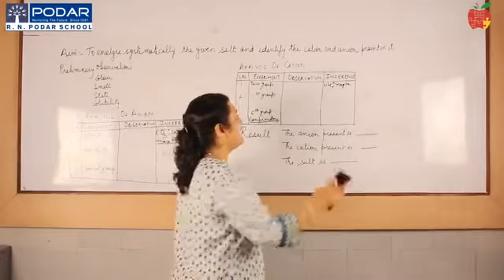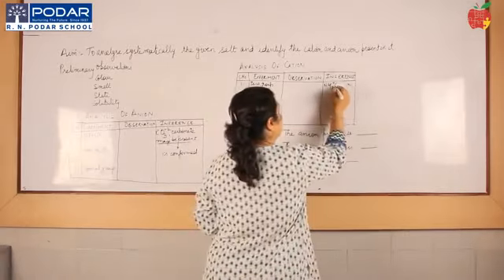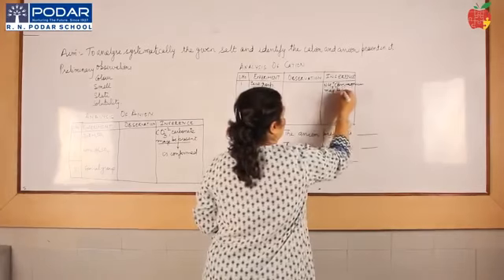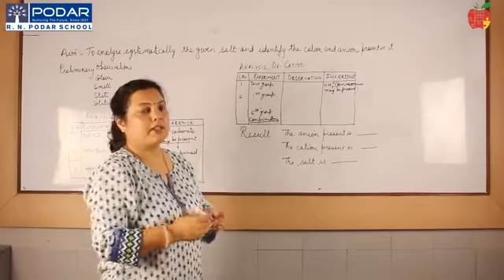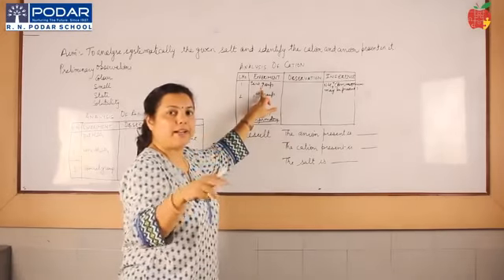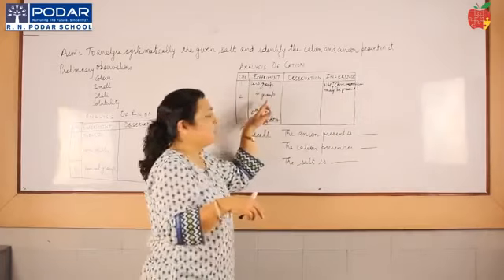You will write down the name also. Just the radical is not enough. You will mention ammonium may be present. Fine. Then when you say may be present, carry out the confirmatory test and there is no need to continue. Now suppose you don't have your ammonium present, then you will say pinch of salt, add NaOH, no observation, ammonium absent. Move on to the first group now.